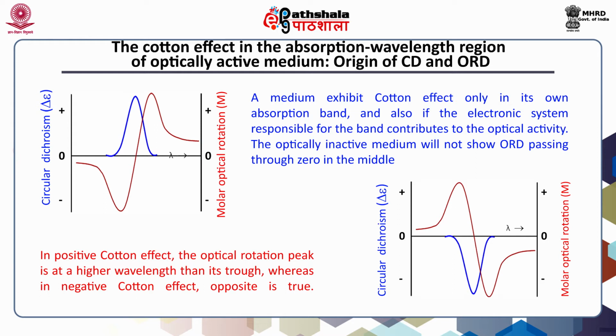You can also see that the absorptive CD band is restricted to a very narrow zone of wavelength, while optical rotatory dispersion, or ORD, away from the absorption band is still going on. This could have several ramifications in the experimental setup and the amount of information gathered. The CD band is located where the medium has a normal absorption band and hence describes the electronic system more accurately.